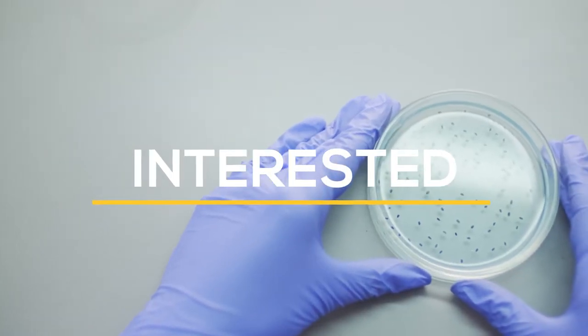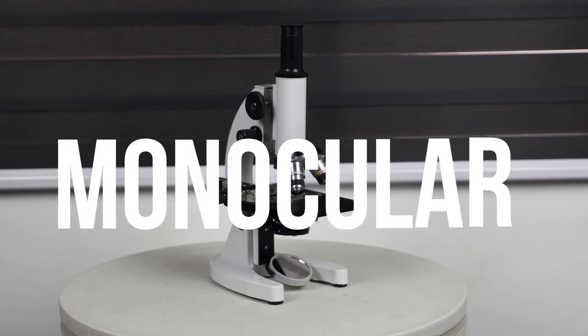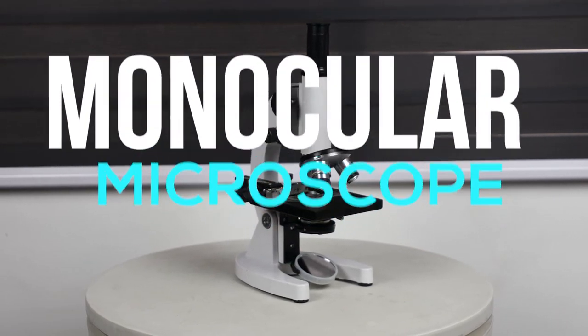Are you interested in microorganisms? Well, a microscope may help you to explore the world of microorganisms.